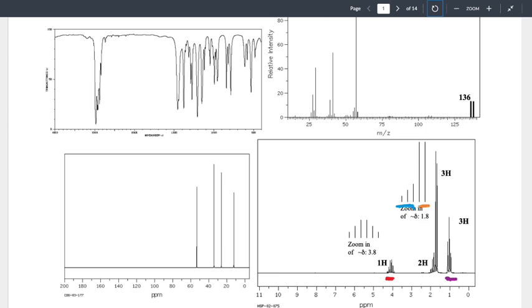That's our integration. For HNMR, because 99.99% of it is the same thing, it's just going to count all of the hydrogens. So if I go through and see, our instrument sees this hydrogen, where would I predict that hydrogen to appear in my HNMR?